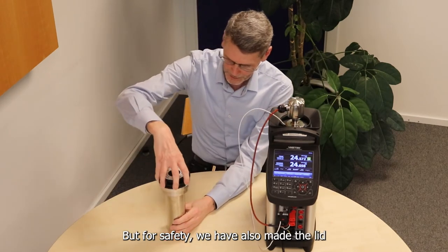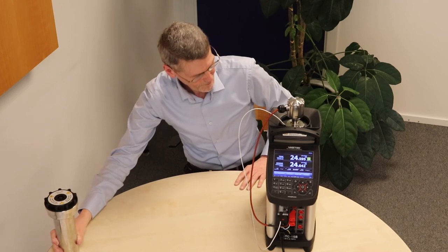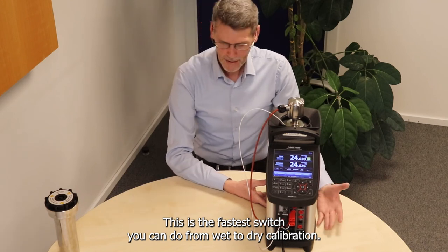For safety, we have also made this lid to put on the container, so now we can transport it safely. Now we are ready to do dry calibration — this is the fastest switch you can do from wet to dry calibration.